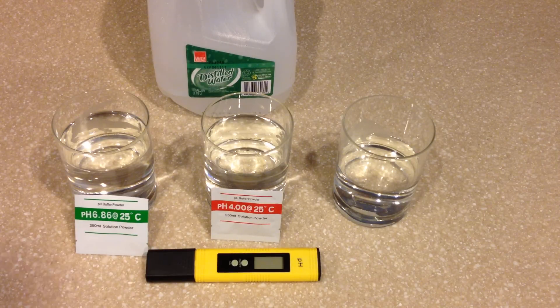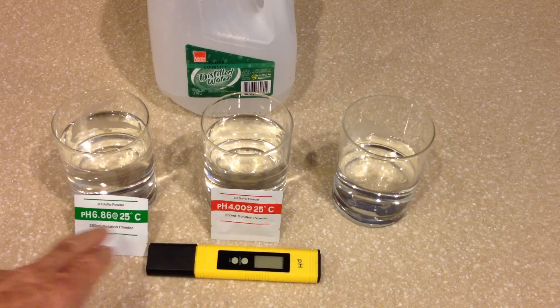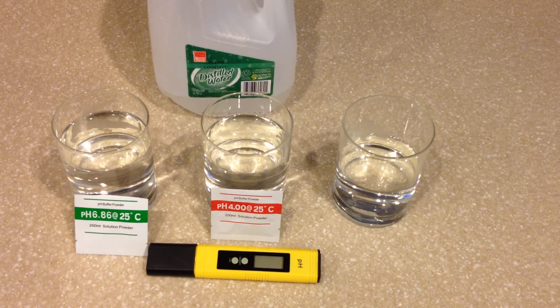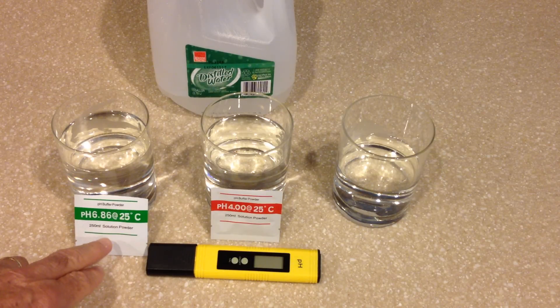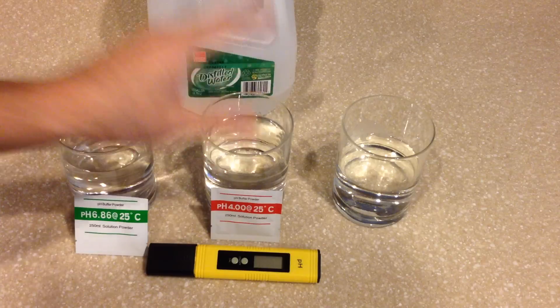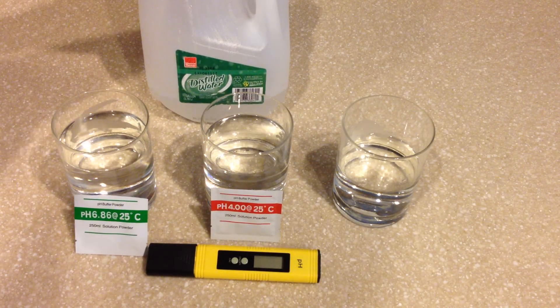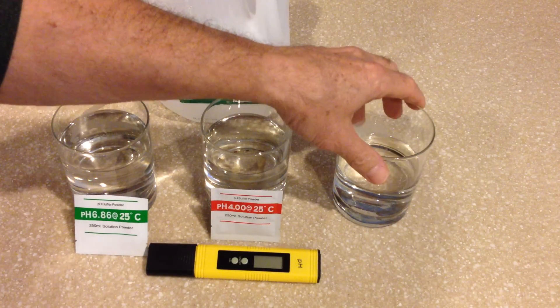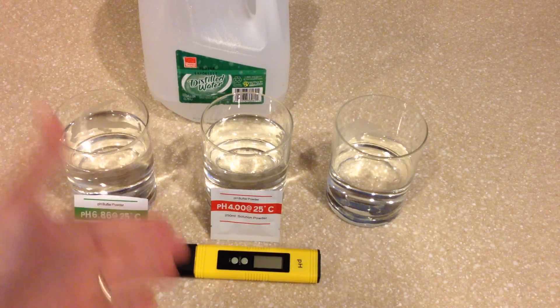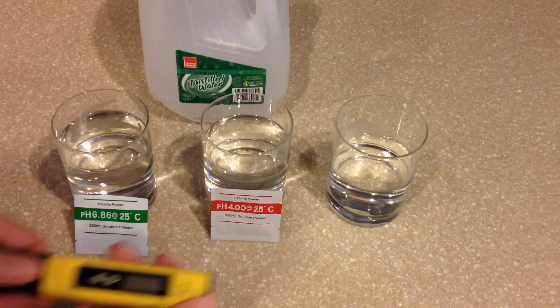So that's what I'm going to demonstrate here. As you can see in front of you, I have the meter itself and then I have the two calibration powders that I've mixed into these two glasses. Each glass contains its respective powder — the 6.86 and the 4.0 calibration solution mixed in 250 milliliters of distilled water. This glass is simply filled with distilled water so I can clean the probe between inserting it into each solution.